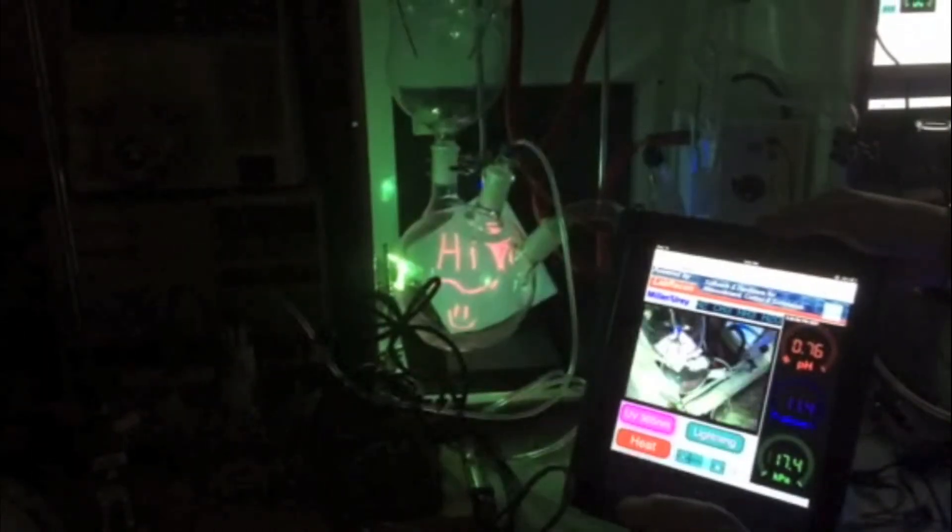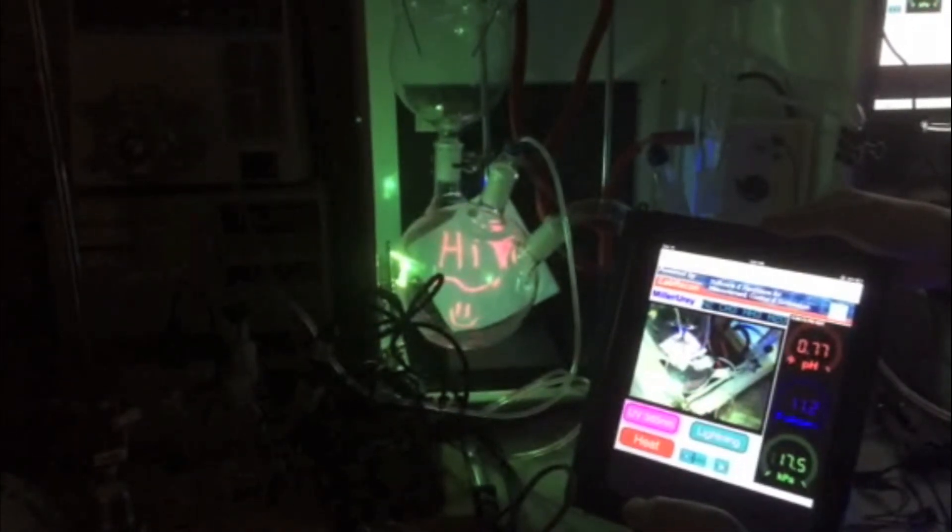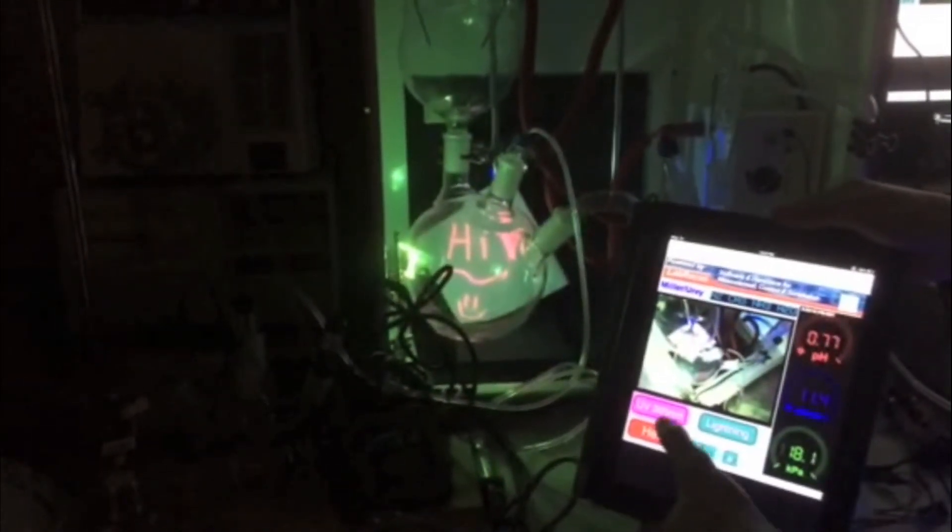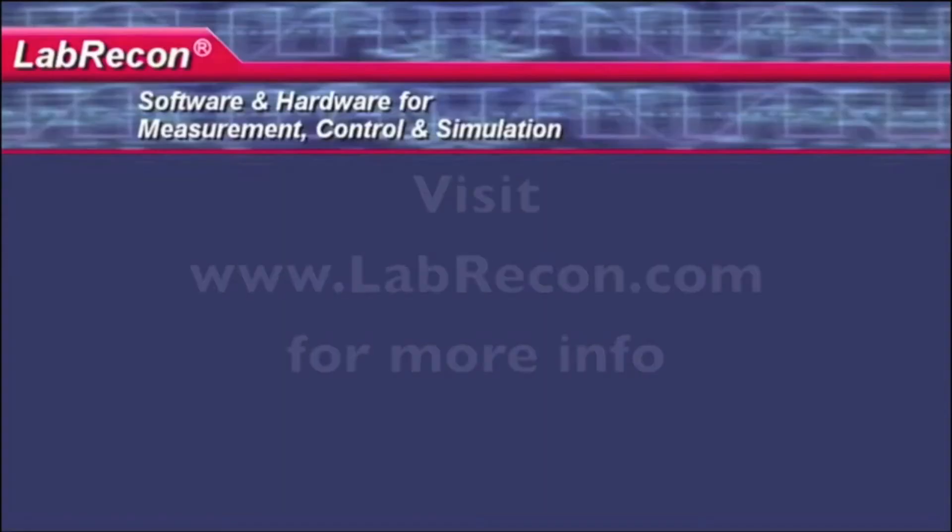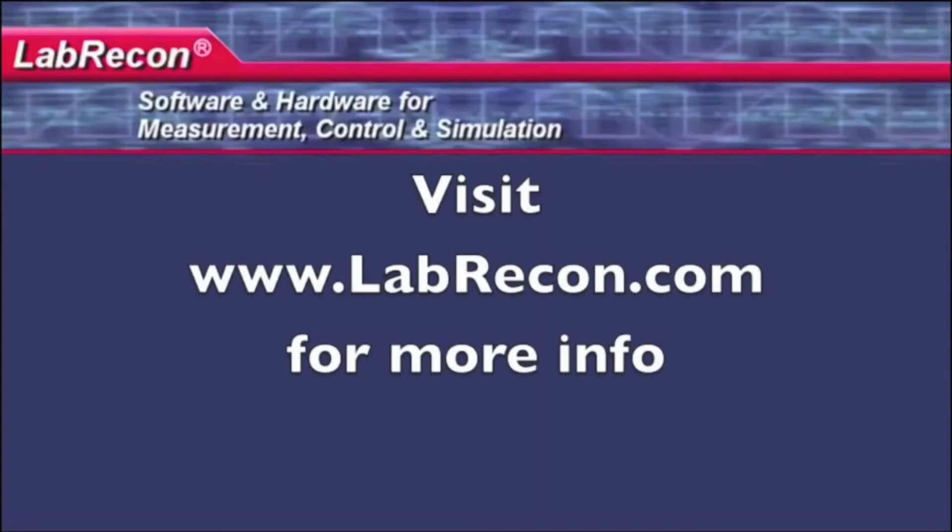We can see the UV light source at work here. When we turn on the UV light source, it illuminates invisible ink, which is only visible under UV light. For more information, check out our webpage with updates coming soon.